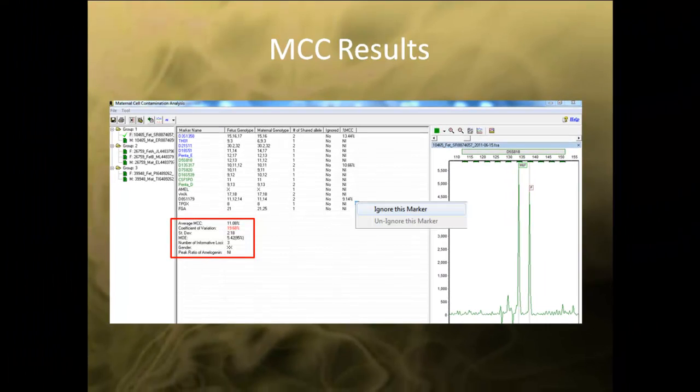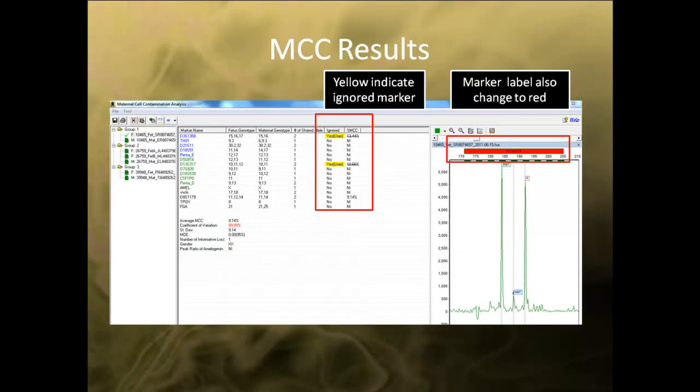In addition, you can also right click on the marker and choose to ignore it from the MCC quantification. When you do ignore the marker, the ignore column will change to yes user and will reprint it with the report. The NI stands for non-informative as there is no MCC detected according to the analysis parameter.